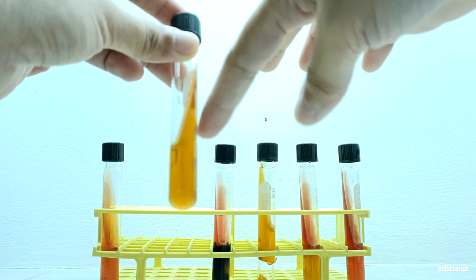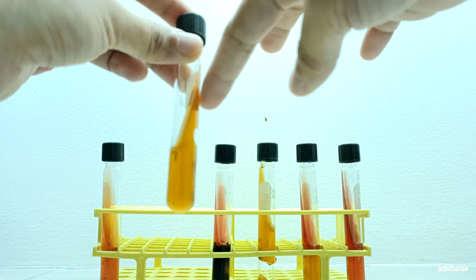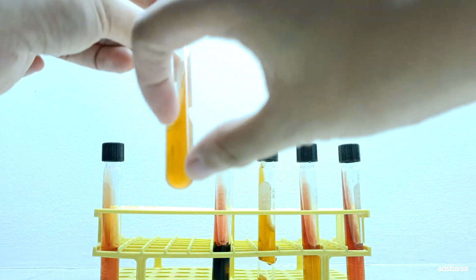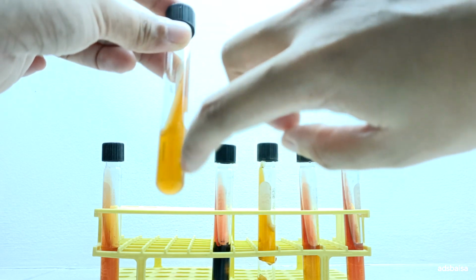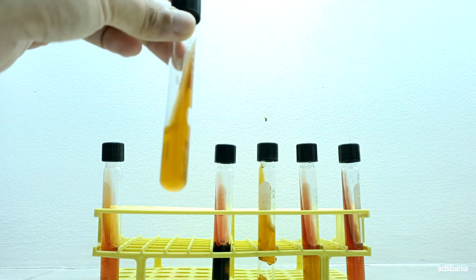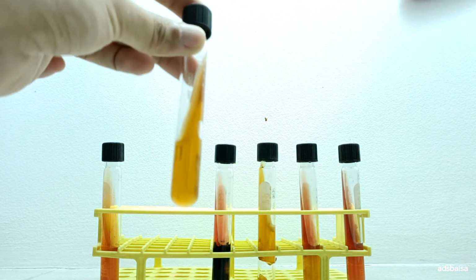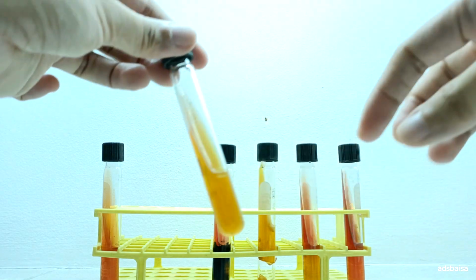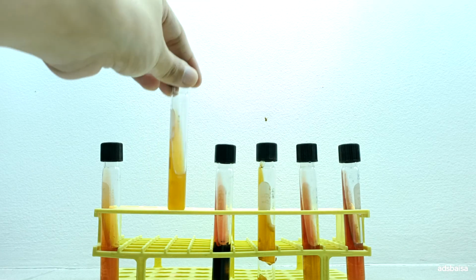That's why the slant turned yellow, and due to the high concentration of these sugars in the butt, the butt also turned yellow, leading to excessive acid formation in the entire medium. So this is A over A.